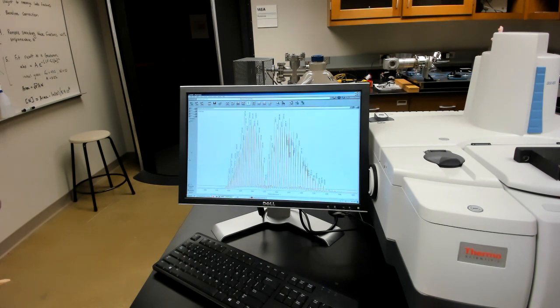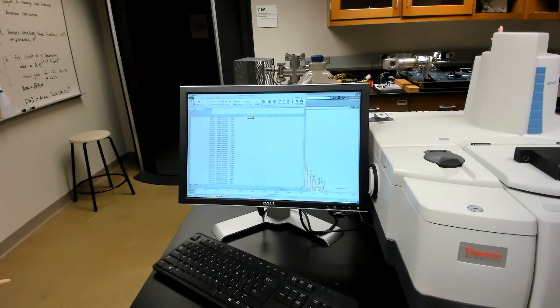We're having to do this a little more carefully because of a complication that I'll talk about in one moment. But now it looks like we have a reasonable set of lines. Okay? I think that's good. Okay, let's stop there. We'll copy the peaks to the clipboard, go to Excel, get a new workbook here, and we'll paste it in. Great.